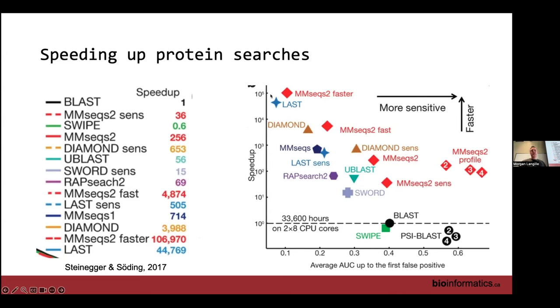It also means that if you've found an interesting pathway in your data, often you want to go back and say, okay, now I want to look at this KEGG pathway and see what actual genes are driving that difference in the pathway. And that's when you see it's really messy. You're like, oh no, it's mostly just this gene. It's not really this pathway. It's hidden a bit from you. It's not often as clean as saying, oh, this pathway is really different. It's much more complex.